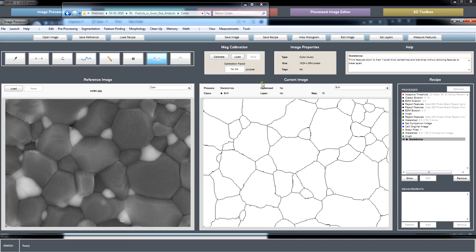Okay. And I think this would also then finally cover the pairing of structures that Katharina had suggested we cover, but I don't believe was able to join us. But if she watches the webinar online later, potentially this could be helpful. She's working with more biological images, wanting to count, say, number of cell nuclei inside of each cell, things like that. This won't take long.